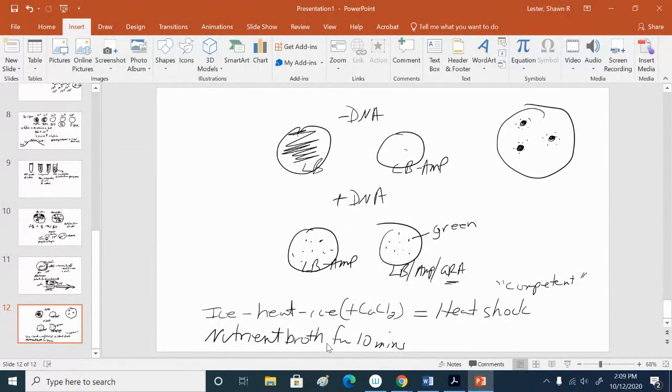Because the bacteria that were transformed destroyed the antibiotic around it and it allows for the other colonies to grow. Right. So the transformed colonies are making so much beta-lactamase that they're destroying the ampicillin in the agar immediately surrounding those colonies, and that creates a safe zone. And so non-transformed E. coli are able to survive and grow, not well, but as long as they stay right next to the transformed E. coli, they can survive. So does that make sense? Yeah.